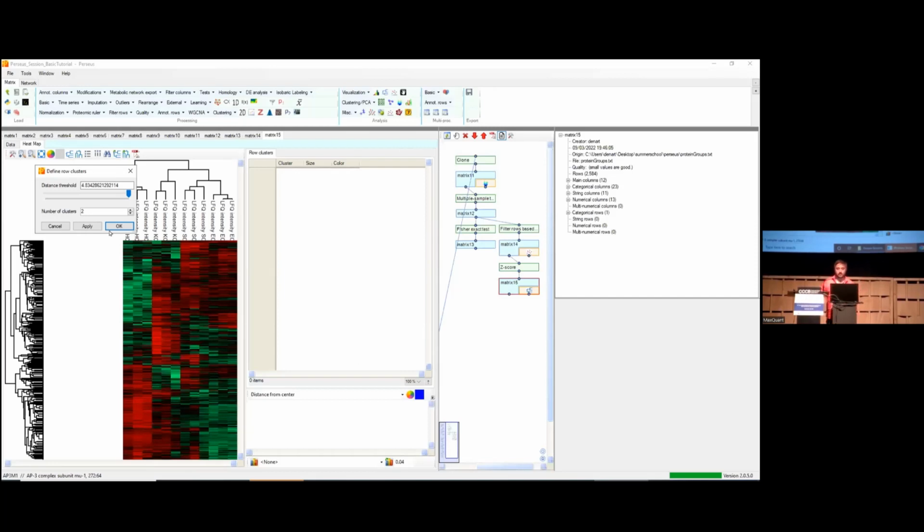So what I would expect, if I set it to 4, is a correlation between these protein clusters and the replicates, right? Because the cell type is also defined by the protein expression. So I just set it to 4 and let's see what happens. What can we see here? First of all, look at this blue cluster. It clearly has a low expression in this cell type, right? And this other cluster has a very high expression in this cell type, right?